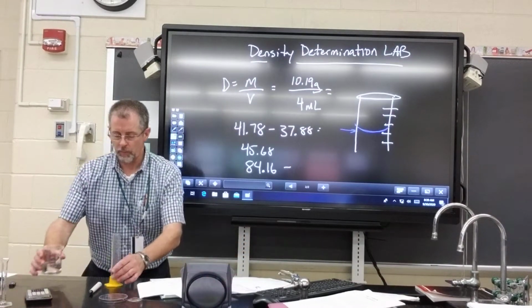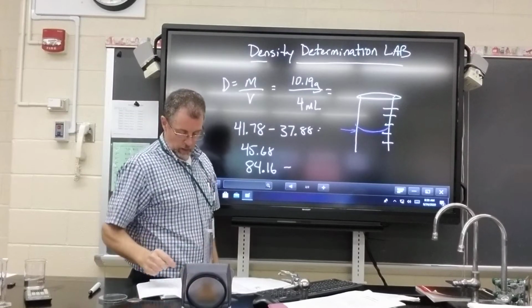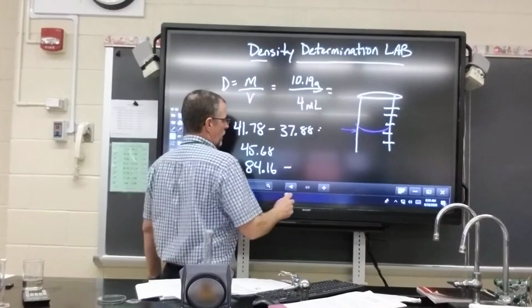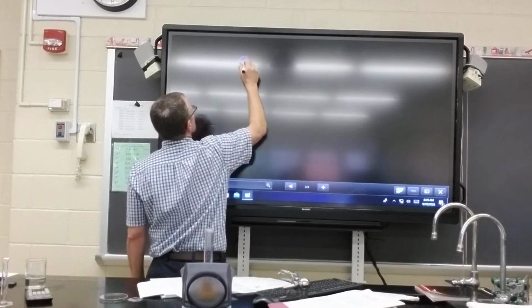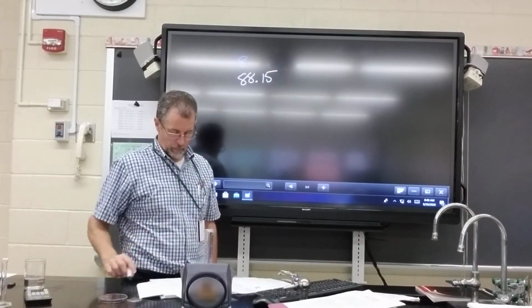Okay, the next one, we're up at 20. All right. And for 20, I got 88.15. That's for 20.